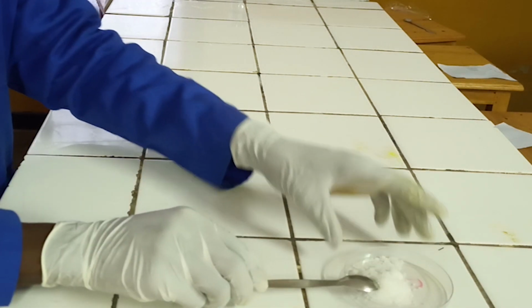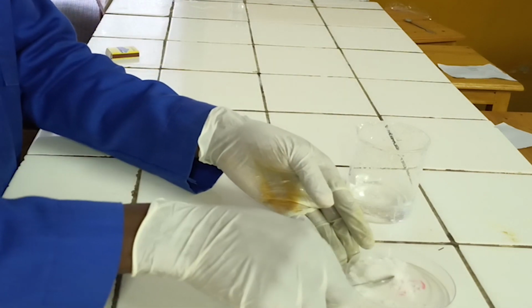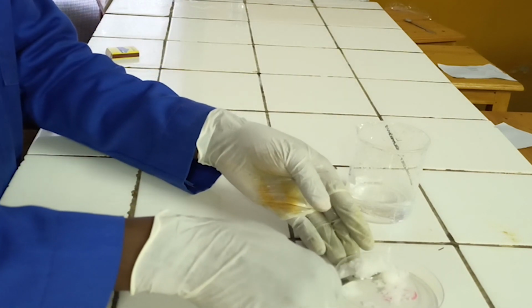Test for bromide ion. First step, dissolve a spatula-full of analyte salt in 50 ml of water.